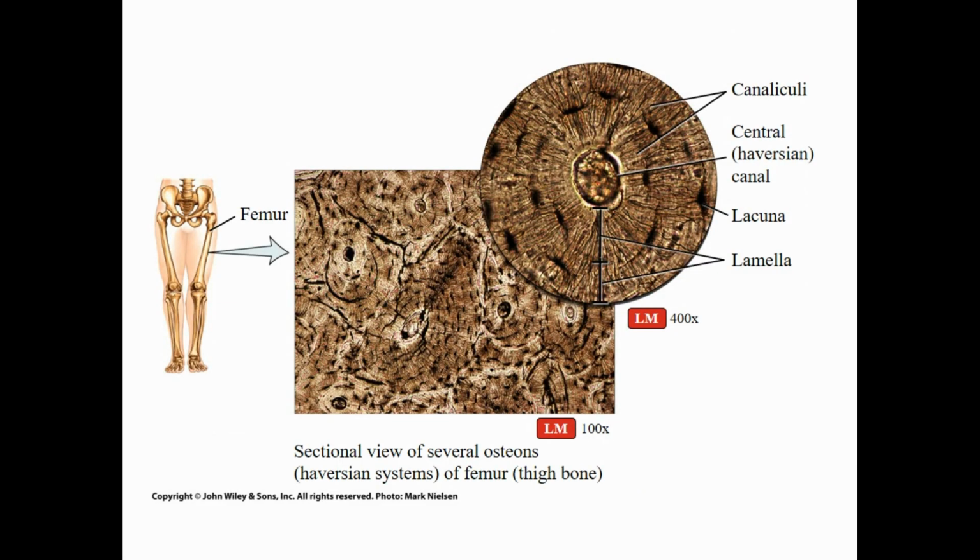And then we move to bone. Bone is a type of connective tissue that stands all by itself. It's very dry compared to the others. It is a hard kind of connective tissue, and it has what we call the concentric ring arrangement. So this is one of those ring systems, and it kind of resembles tree rings.